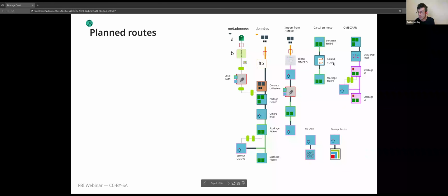I haven't shown it, but the system is quite easy to hack. Not to hack in a malevolent sense, but to use with the Python interface. So you can use it through Python. You don't have to use the web service directly. What I hope for is very standard workflows. If you have in your facilities or in your work cases very standard workflows, those could be automated to go directly into the solution without you having to fill in an Excel file.